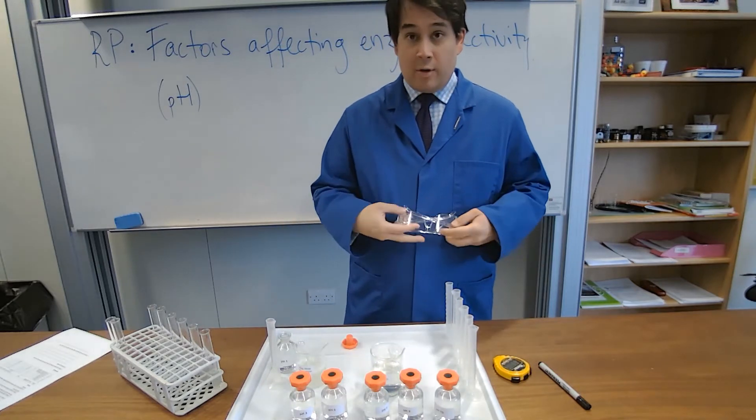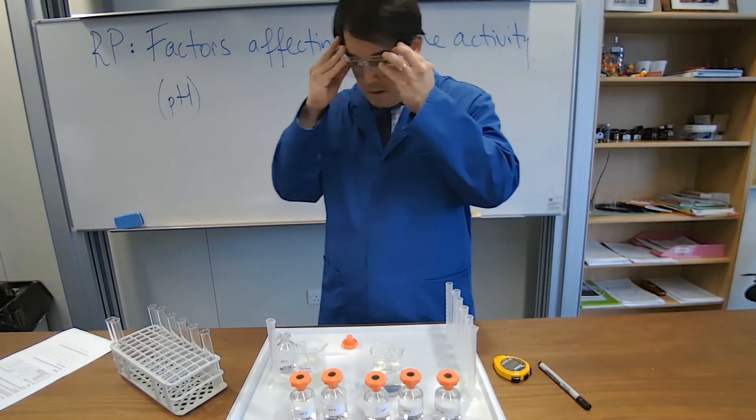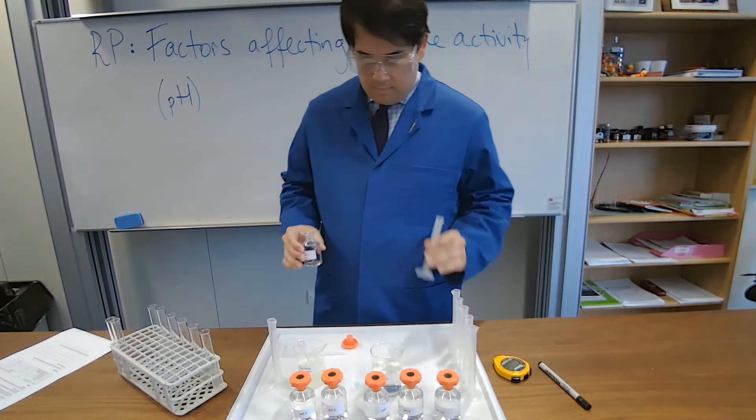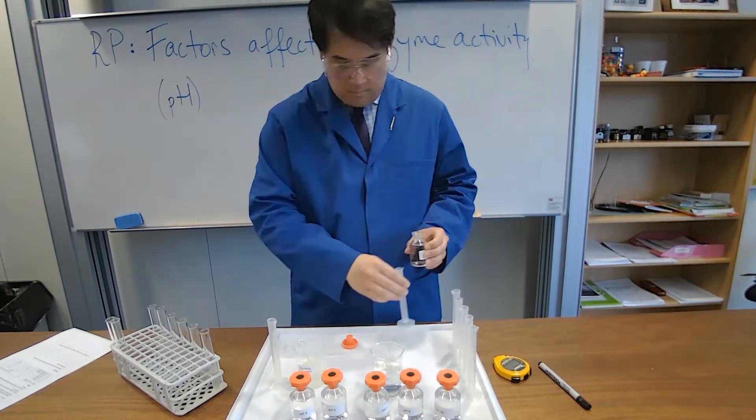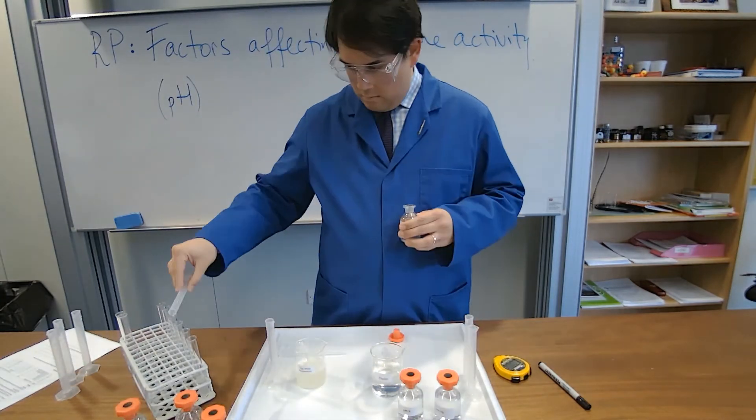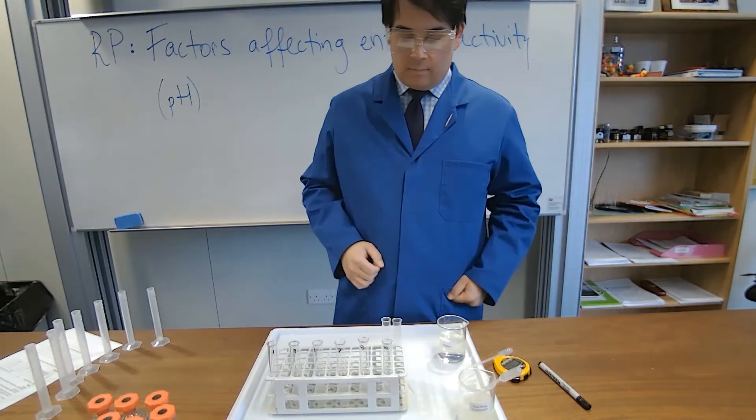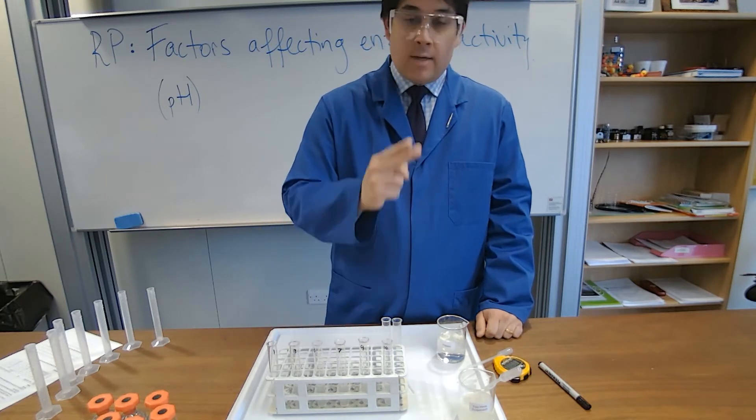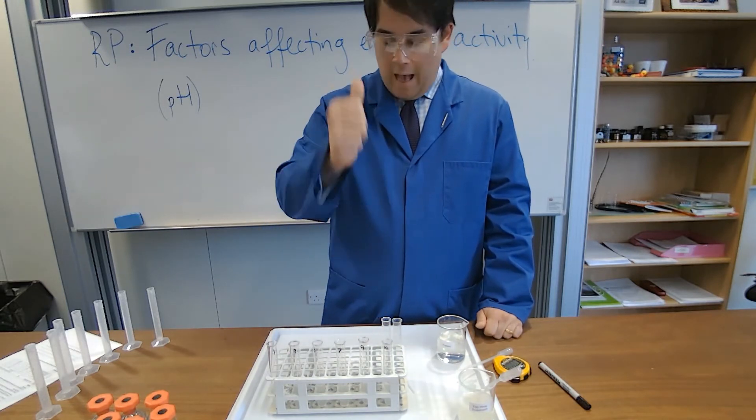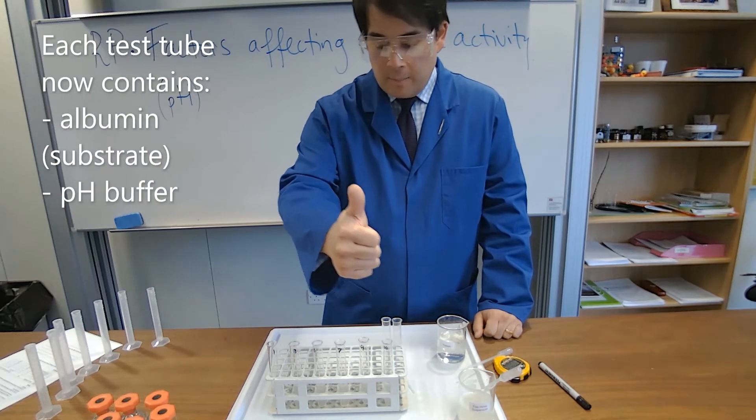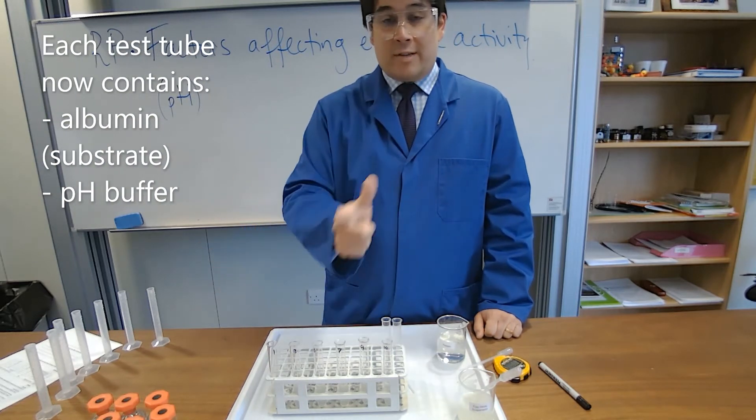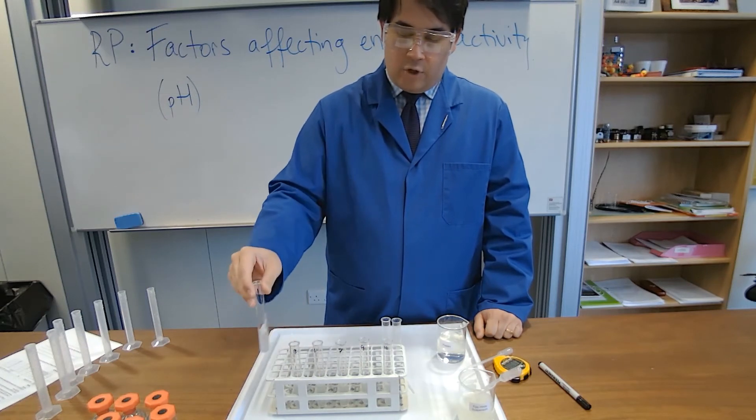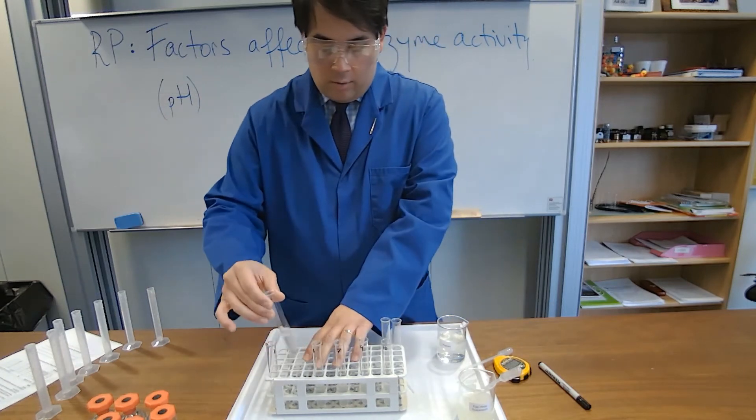Now that I've done that, I have all the different test tubes there with albumin, which is our substrate. I have also the pH buffers added in, so they're all at the relevant pHs. I've given it a little shake to make sure that they're all mixed in.